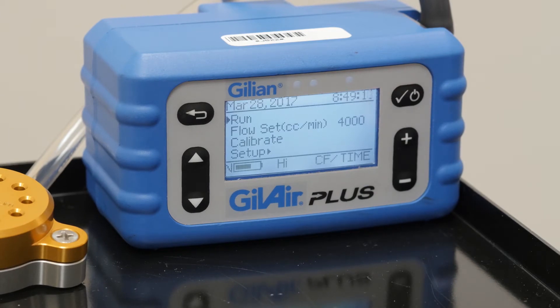Using the up-down arrow buttons, select the run option and click the check power button again.